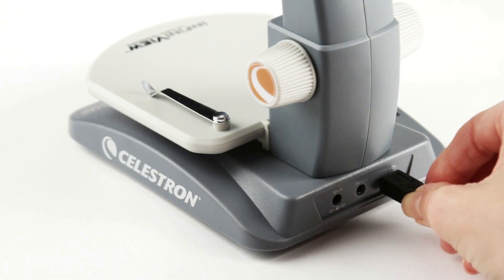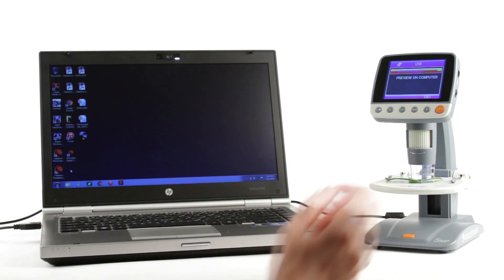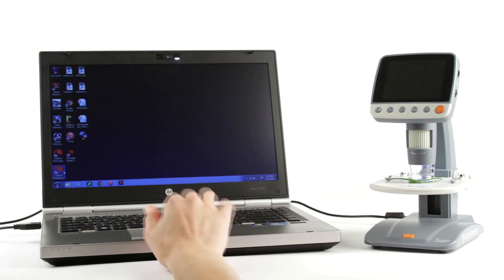Get even more features when you connect the microscope to your Mac or Windows PC via USB 2.0. You'll be able to measure specimens, save images directly to your hard drive, and more.